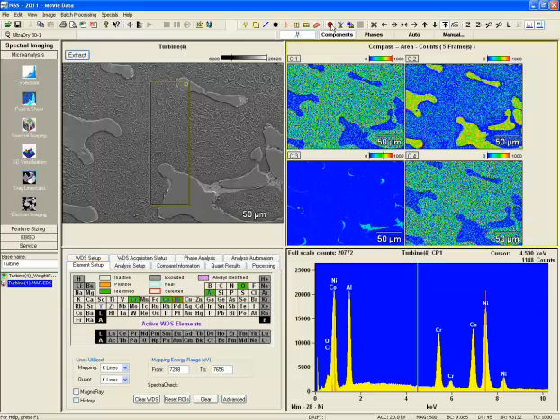We've seen that distribution before in the 2-phase material in the maps. The second component up on the right has an enrichment of chromium and cobalt. That is a phase that we had also seen previously, so there's not too much surprise there that it found it. The 4th one, down in the lower right-hand quadrant, is very, very similar to number 1. It has higher nickel and cobalt.